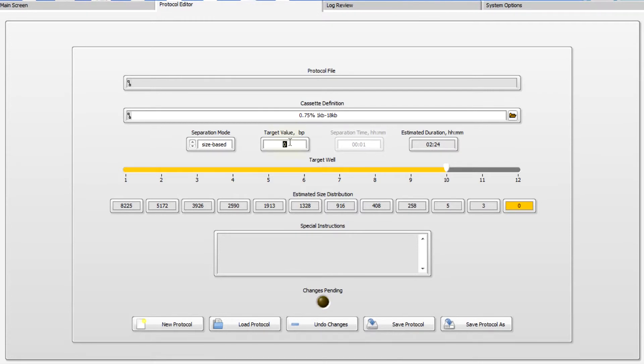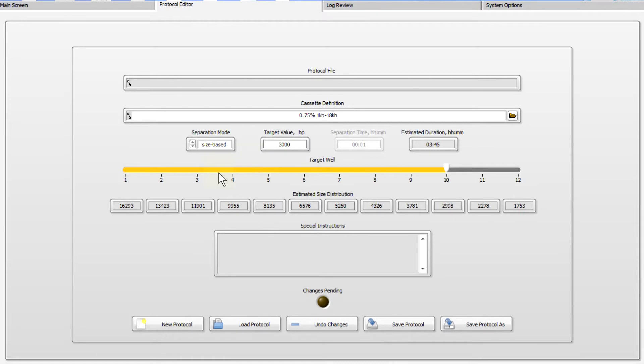In the remaining wells, values will be estimated. For most accurate collections, every well target should be within the range indicated in the cassette definition.